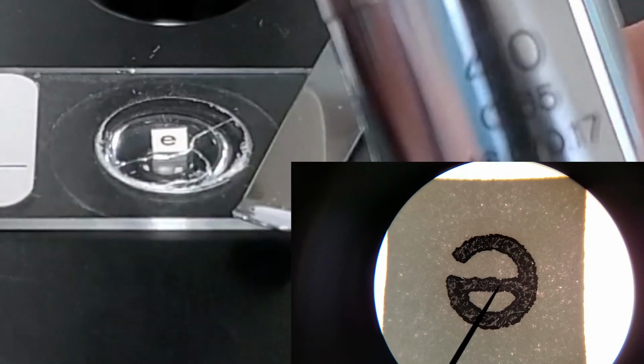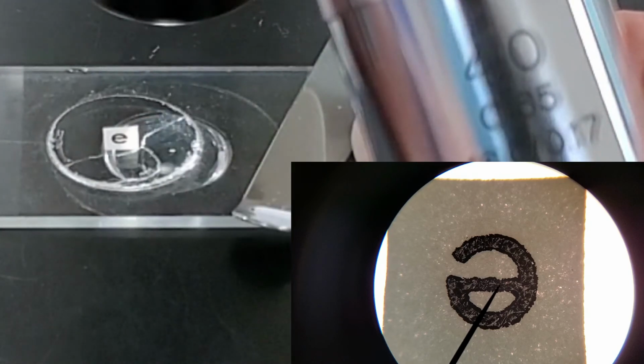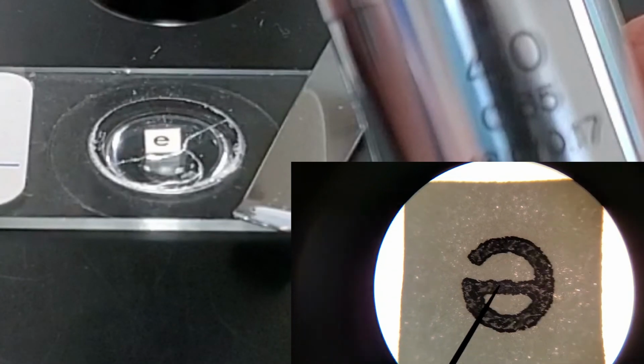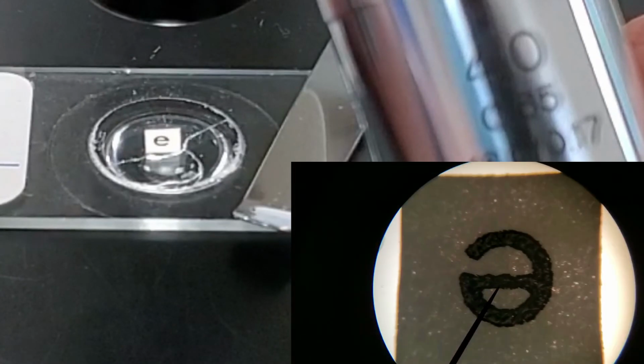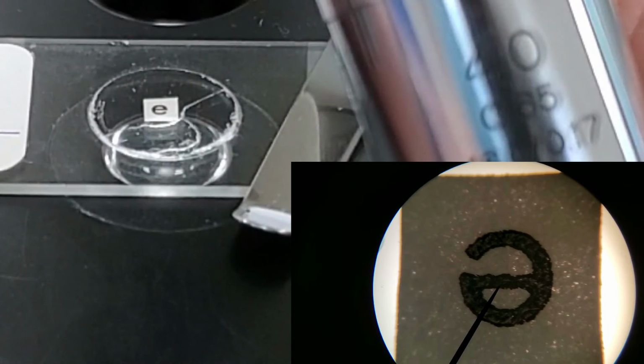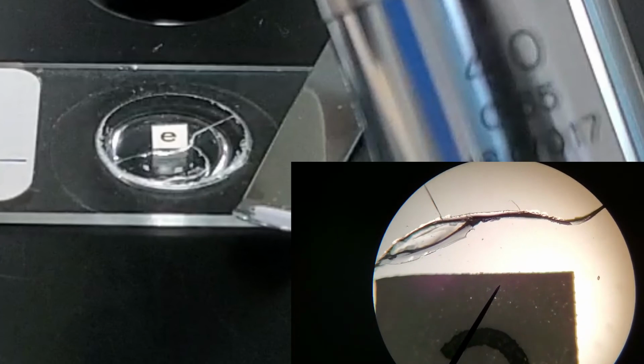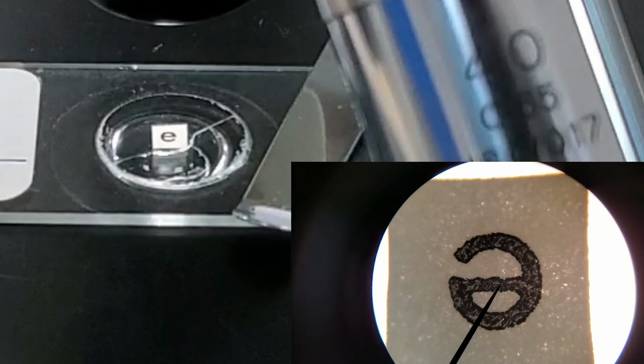What that also means is when you move the sample on the stage, if you move it to the left in the field of view, it's going to move to the right. If you move a sample on the stage up, it will appear to move in your field of view down. So if you want to move an object up and to the left in order to get it into the center of your field of view, you're actually going to have to move it down and to the right on the stage.